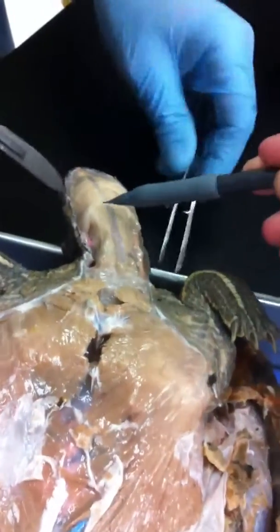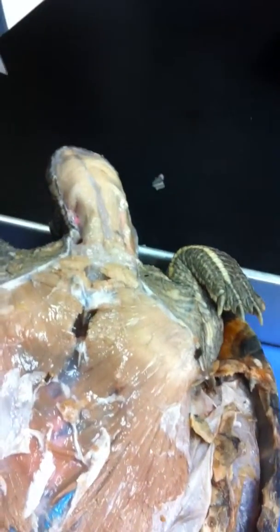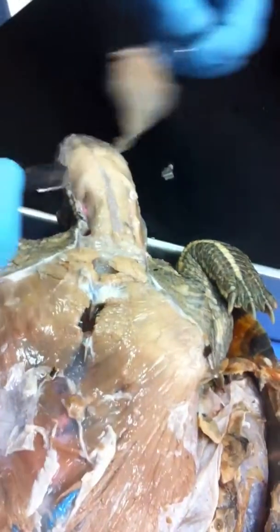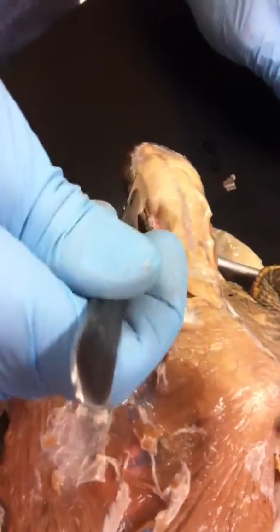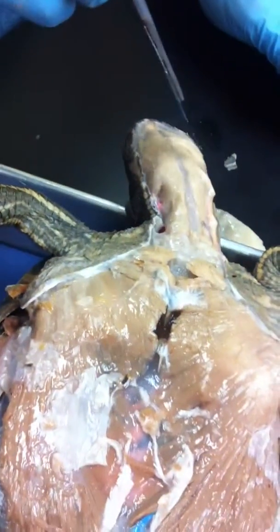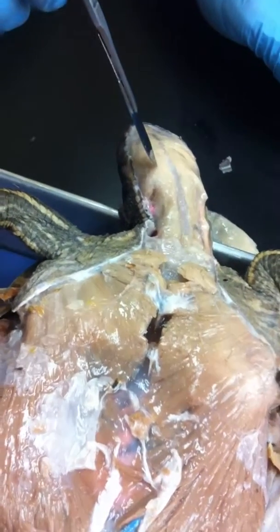This is stuff I peeled off. So you've got one on this side which is intact, and it goes to this side. So there's an omohyoid here and one underneath there.